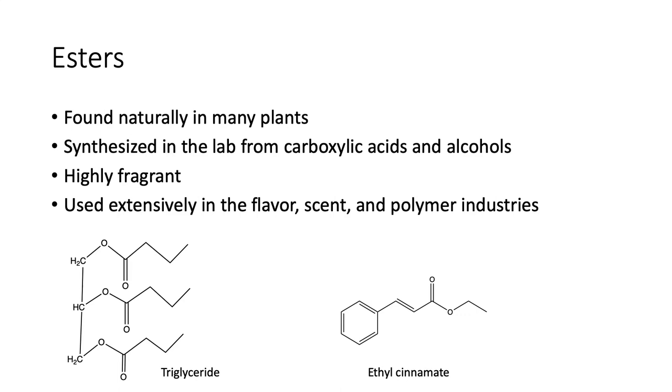And talking a little bit about background information about esters, they are found naturally in many plants. And you can synthesize them in the lab from carboxylic acids and alcohols, which we are going to be doing. They are highly fragrant, as you will experience when you do this lab. And as such, they are used extensively in flavorings, scent, and polymer industries.